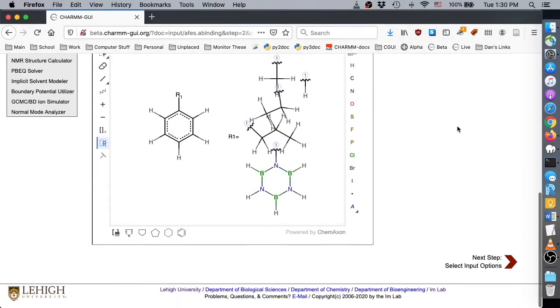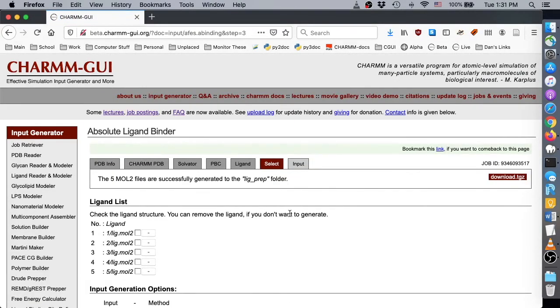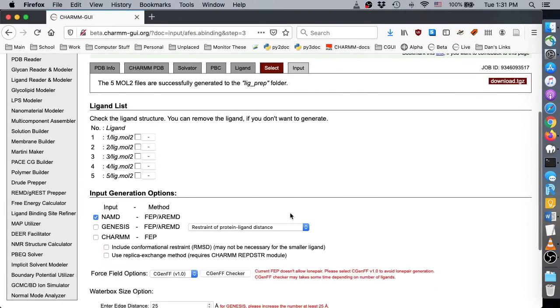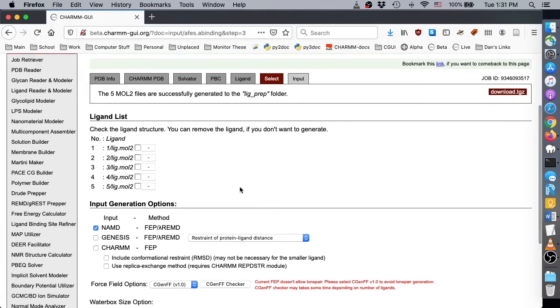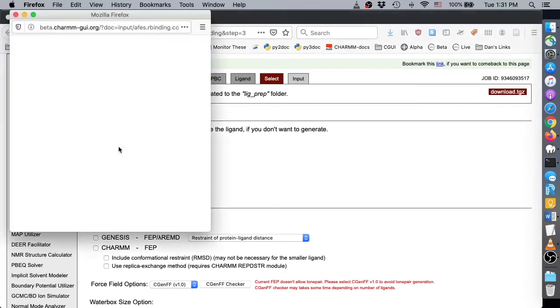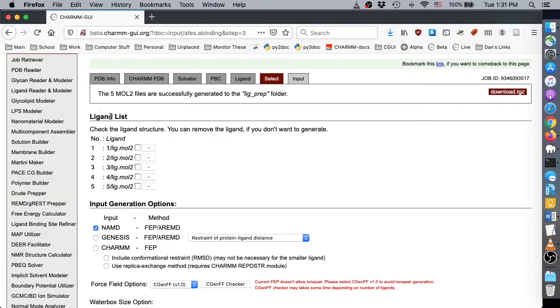Once the structures are drawn, we click the Next button to see free energy perturbation options. Because we drew structures instead of uploading them, the structure names are automatically generated. To see which structure is represented by a number, click the structure name in the list here.